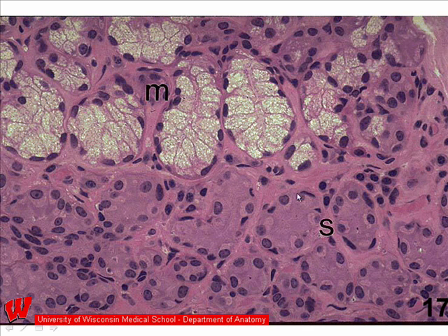By contrast to the mucus glands, the serous glands have more rounded nuclei in appearance. Again, it's difficult to see the lumen at the center of the acinus, but because the cells are secreting a serous or fluid secretion, they have a darkly staining appearance because of the enzymes and other substances that are found within this serous secretion.